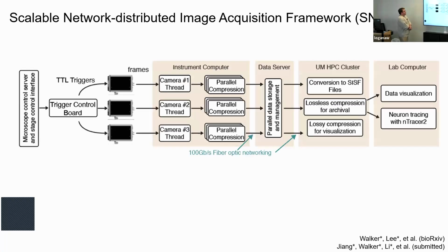So to deal with the onslaught of data, we developed this thing that we call the SNDIF, or Scalable Network Distributed Image Acquisition Framework. The name's a little bit of a nightmare there. And the idea here is that we've kind of taken all of the steps that would normally happen inside of a microscope. If you go to the imaging core somewhere in the med school, and you rent a microscope for an hour, the software that you control there, whether it's the Zeiss software or what have you, will be doing a bunch of different tasks all inside of one desktop application.